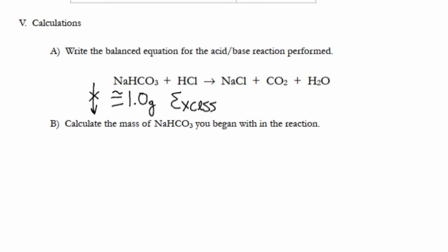You won't see the salt, because what does salt do in water? It dissolves. Guys, you're going to make carbonated salt water. In theory, you could drink it, but don't, because everything in lab is dirty. But guys, seriously, all you're doing is making carbonated salt water. Now guys, to do a percent yield, we need to weigh one of these. So of the 3, which is going to be the easiest to weigh? The salt, the carbon dioxide, or the water?